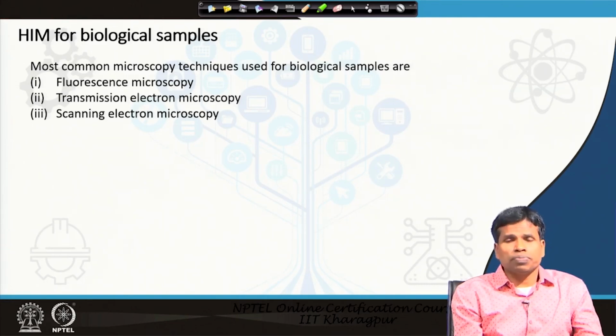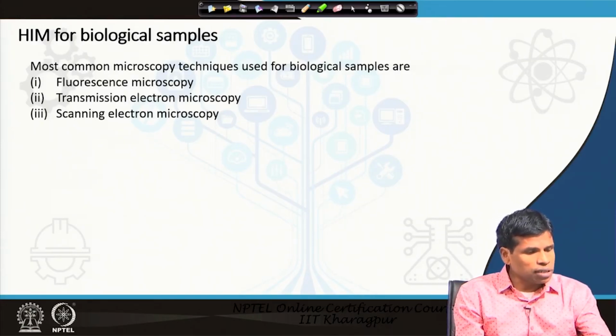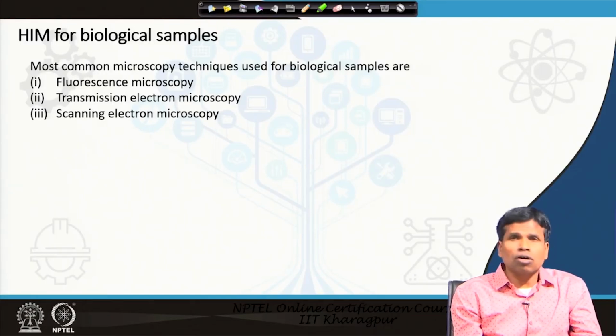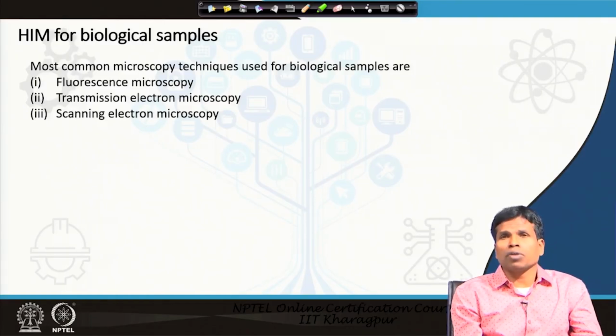In fluorescence microscopy, the biological samples are labeled, and when imaging occurs, we see the positions that are labeled, not the overall morphology of the specimen. And when labeling is done with a biomaterial, it means more sample preparation steps; it is not straightforward or direct.